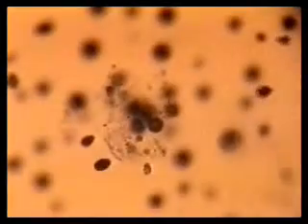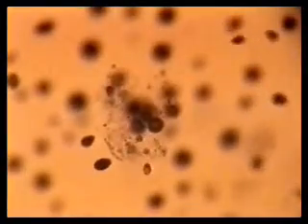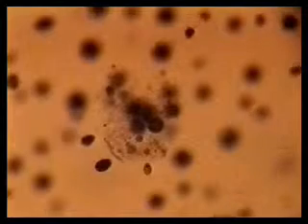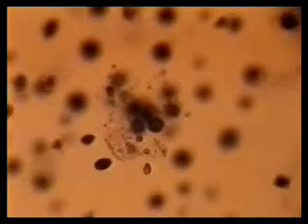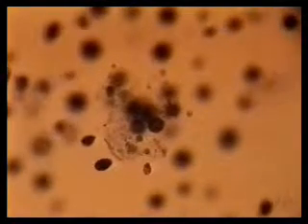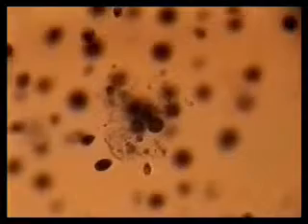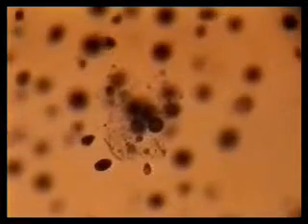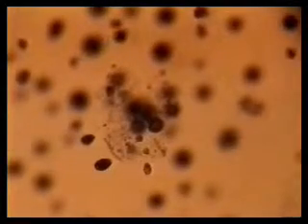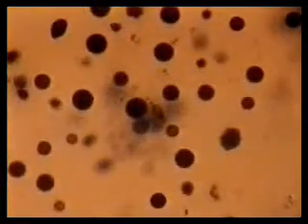Turn off the fluorescence, and turn back on the regular illumination, and acquire another image. And this will be the last time through our repeat loop, so the program will stop here.